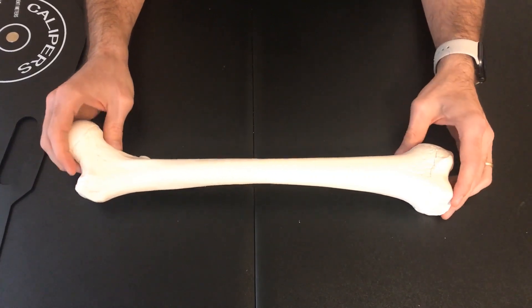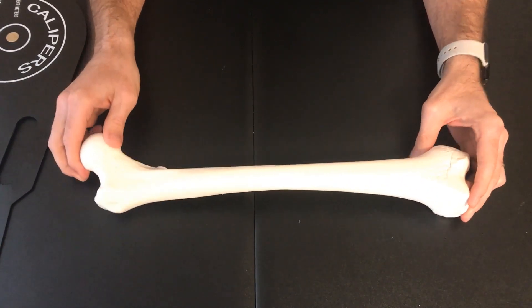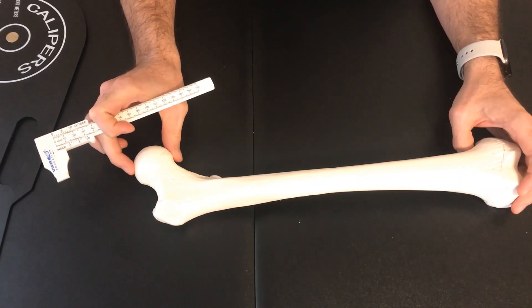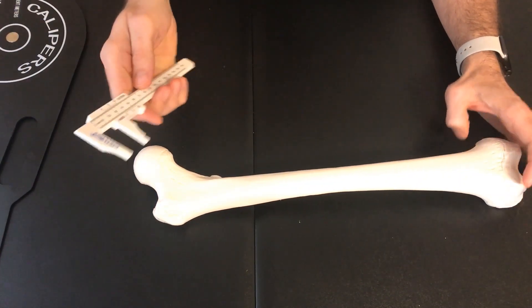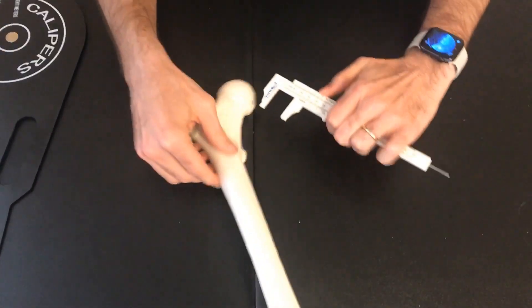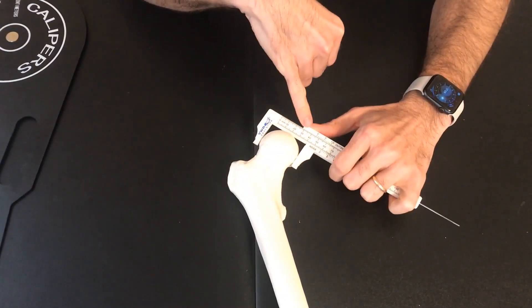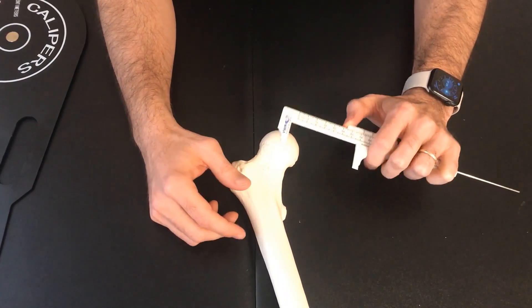We'll start with the sex determination on the femur. The first characteristic we're going to measure for sex determination is using the vernier calipers to measure the vertical diameter of the femoral head. Here is the femoral head — the vertical diameter is this measurement, as opposed to the transverse diameter. We'll place the calipers and pull them tight, and we see a measurement of about 46 millimeters. Males are typically above 44.5 millimeters.